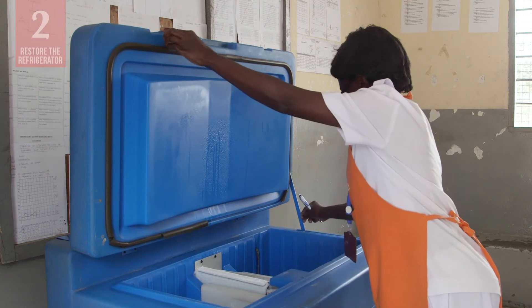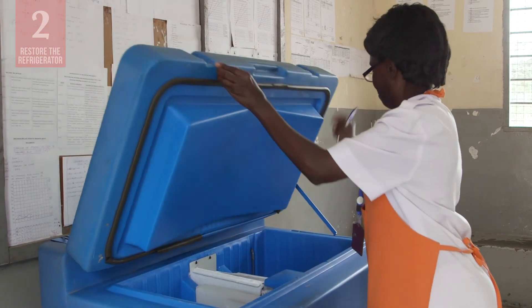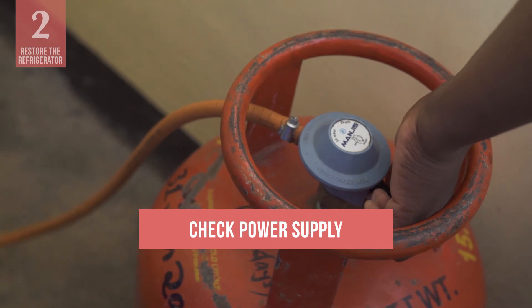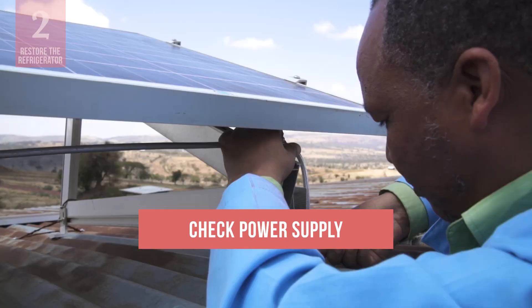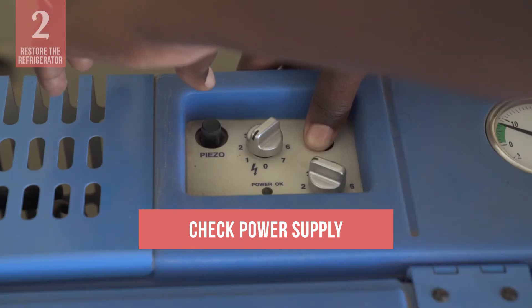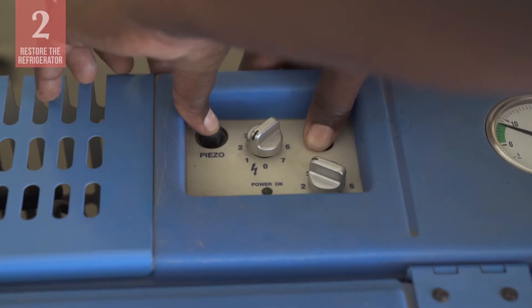The other main task is to restore the refrigerator to working order. First, check the electricity, gas, kerosene, or solar power supply. Deal with any interruptions by restoring the power or refuelling the unit.